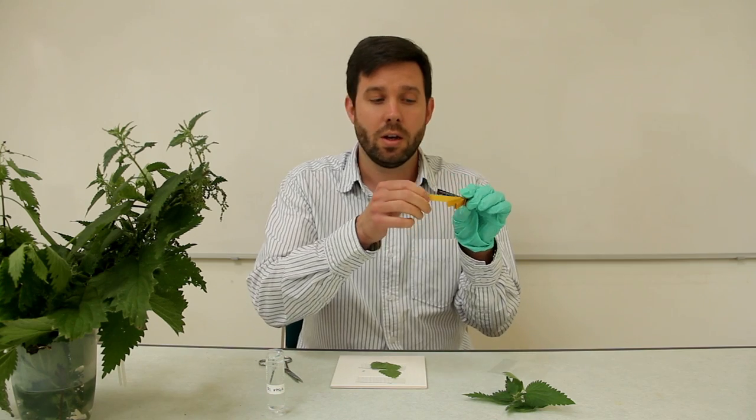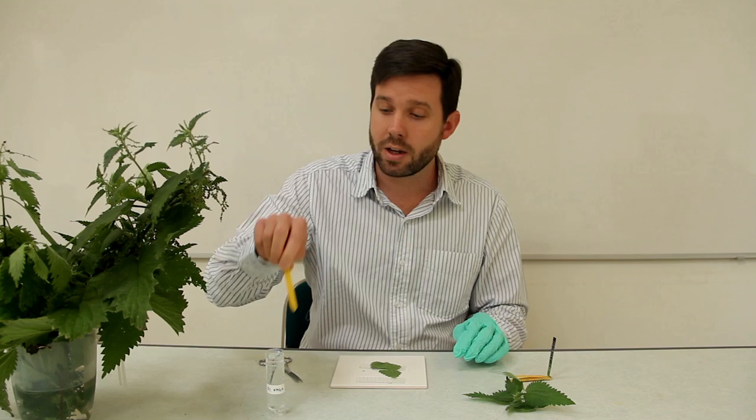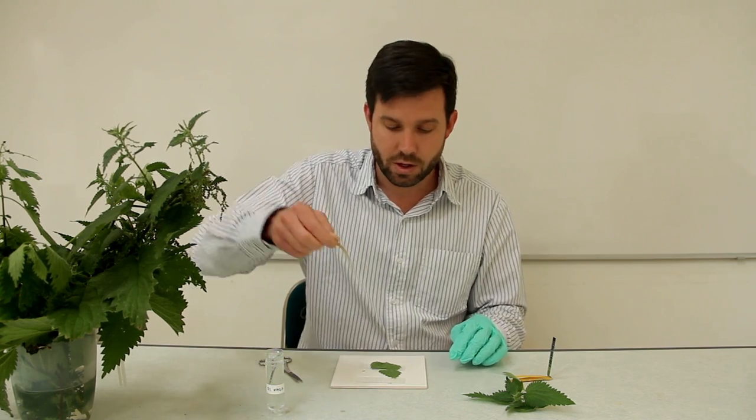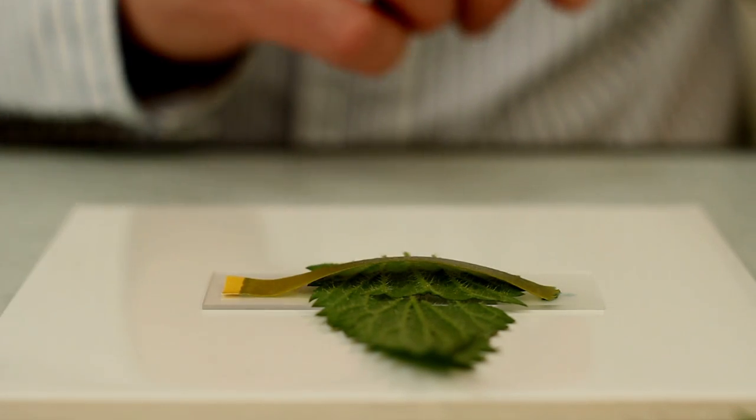You take a piece of universal indicator paper — just standard universal indicator paper — and you're going to dip that into tap water just to moisten it, then you're going to lay it over your piece of stinging nettle.